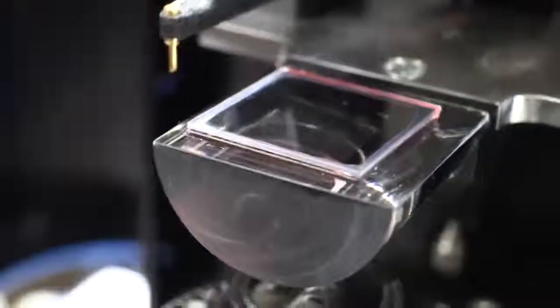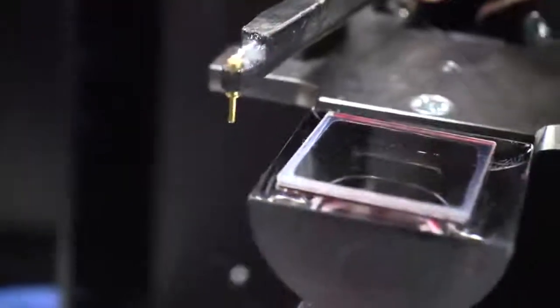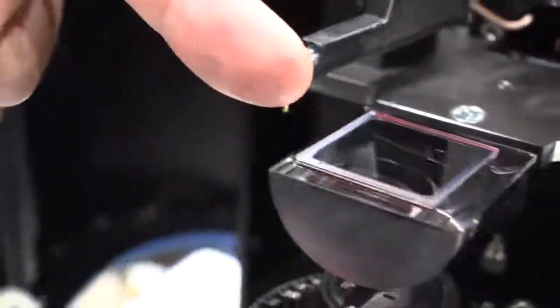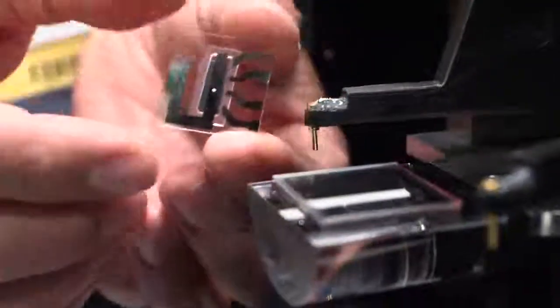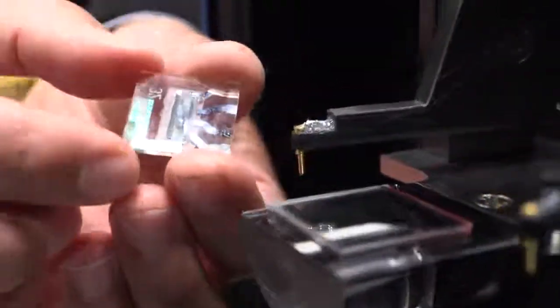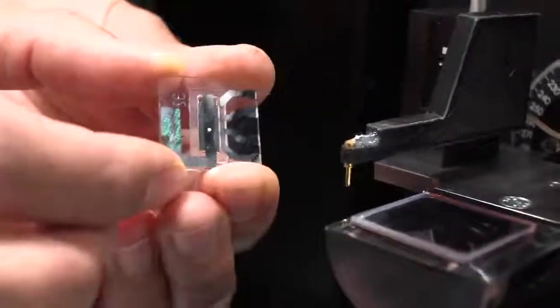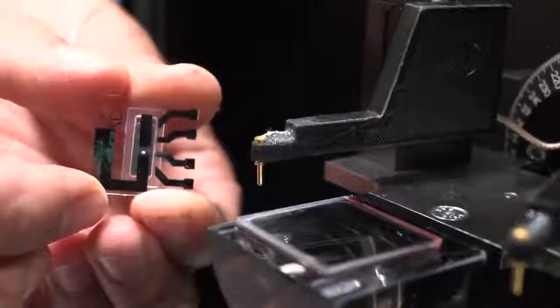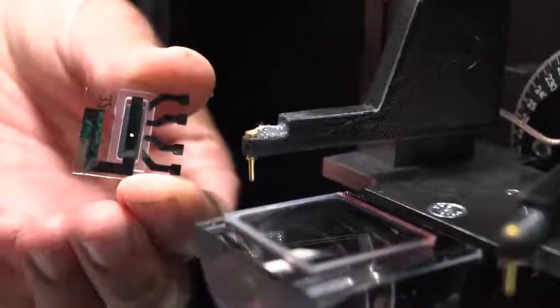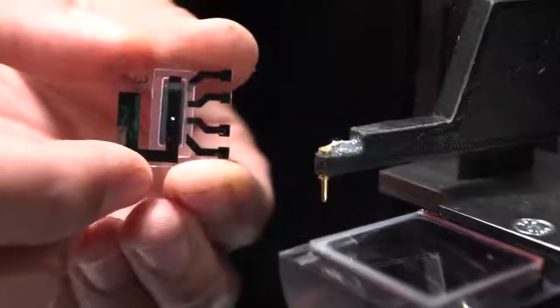So this is part of an OLED display or pixel? Yes, this is a large area film. This film that looks transparent will then be used in an OLED. This is now a research OLED pixel. There are a few OLEDs here inside, just 4 of them. It's not a high resolution display, it's just made to improve and optimize an OLED stack. OLED stack means there are thin films of OLED materials that make up the OLEDs.